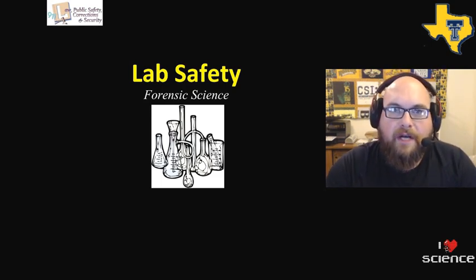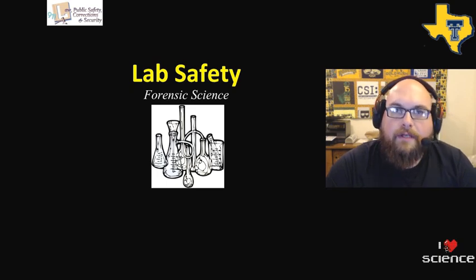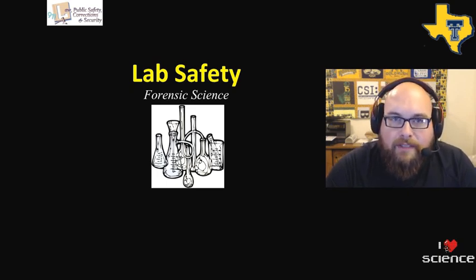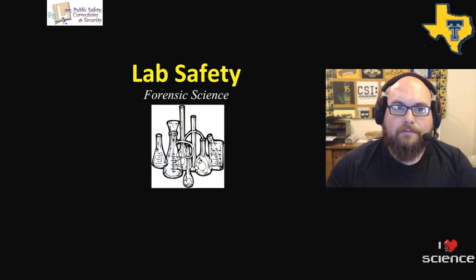Today we're going to be talking about lab safety because our classroom is a science classroom, and at times it will become a laboratory, or however you would like to say it. So we need to talk about some safety precautions and safety procedures so that we can minimize accidents in the classroom.